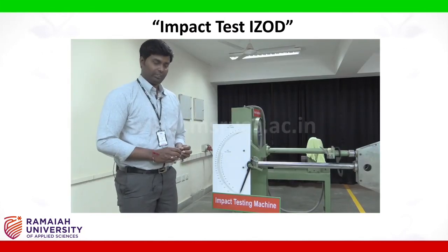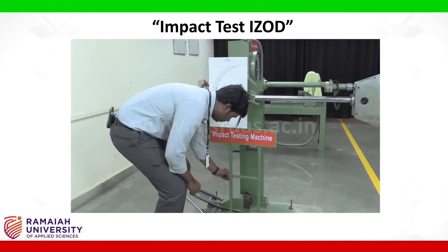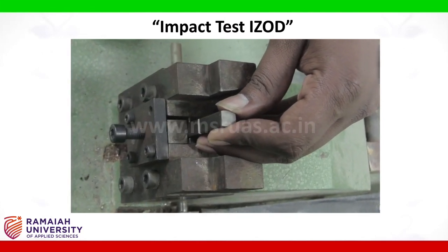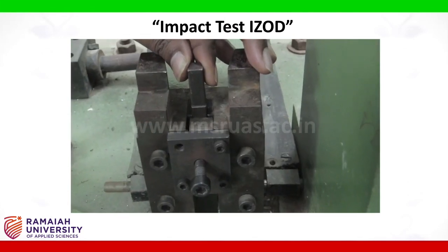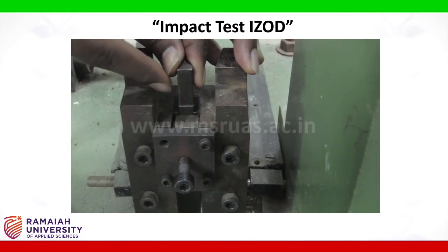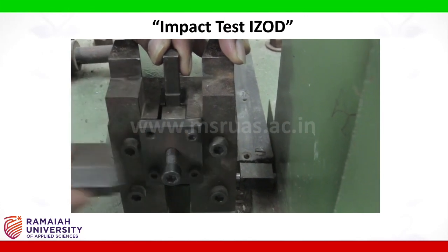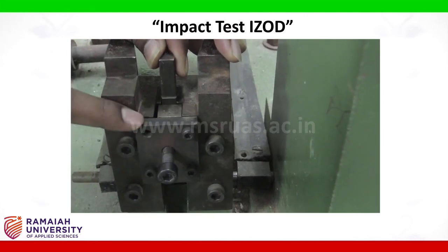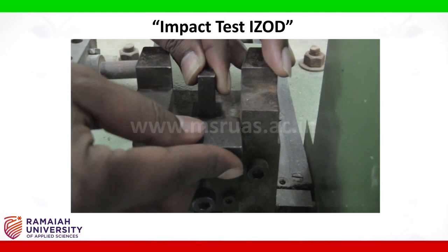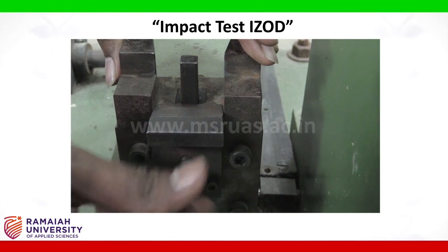To start the test, first we need to keep this specimen in the specimen holder. For the Izod test, we need to place the specimen in such a way that this notch should face the striker and then the bottom edge of this notch has to come exactly over this surface. So to keep it in such a way, we can make use of this wedge and then tighten this screw.